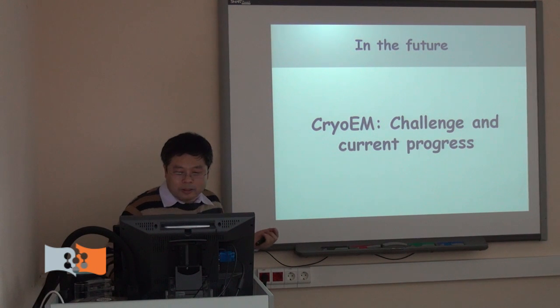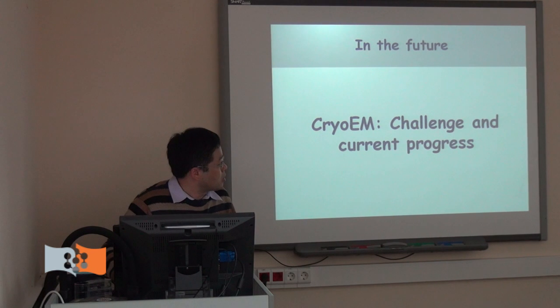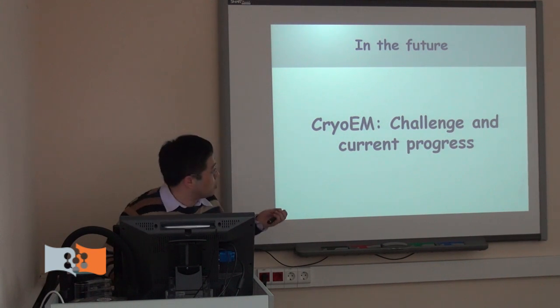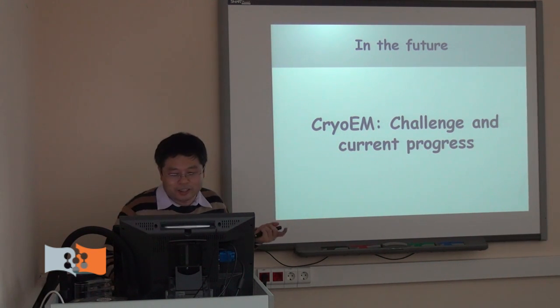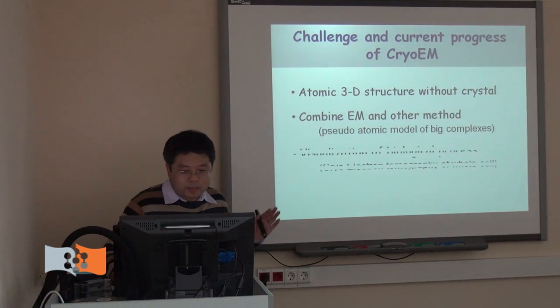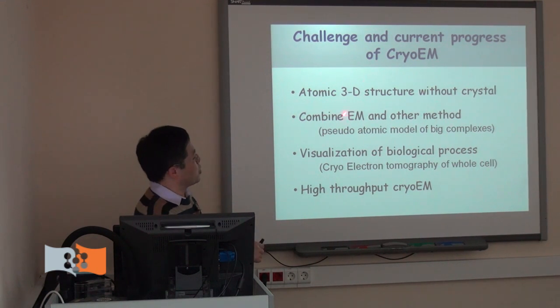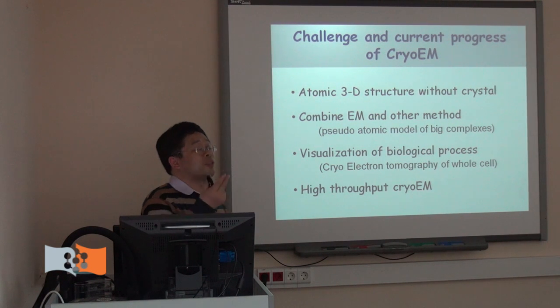At the end of this session, I will give you some challenges and the current progress of the cryo-EM field. The challenges in the development of this field are focused on several things. First, we want to improve the resolution.